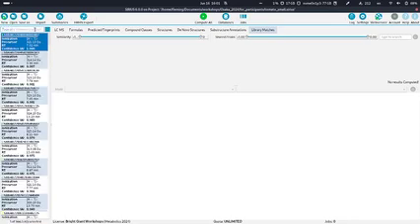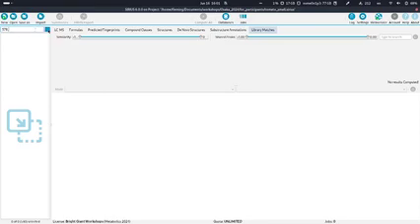Let's now clear the filter and look at some other examples. For example, now we are looking for a compound which has the mass of 578. So now we are filtering by mass, and we're looking for 578. We can just type it here and a dot, so it only gives us the masses and doesn't search in the compound name.